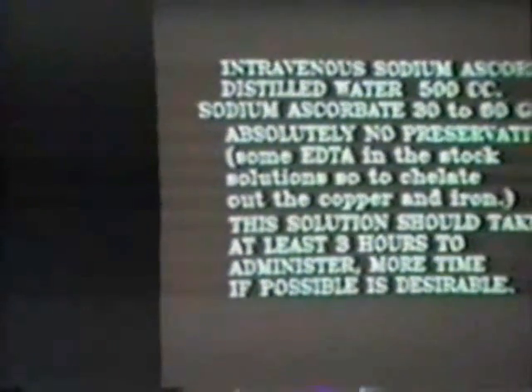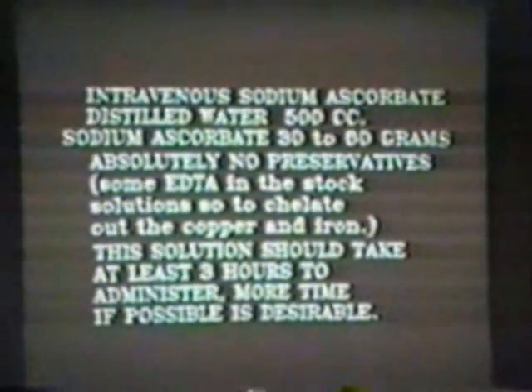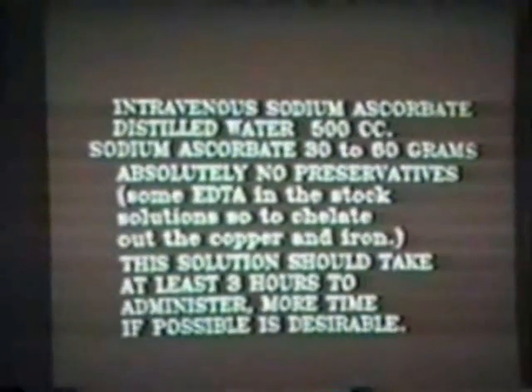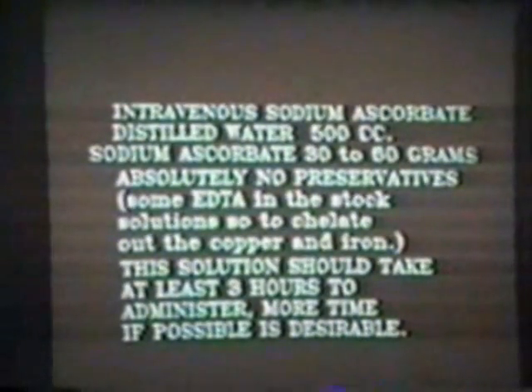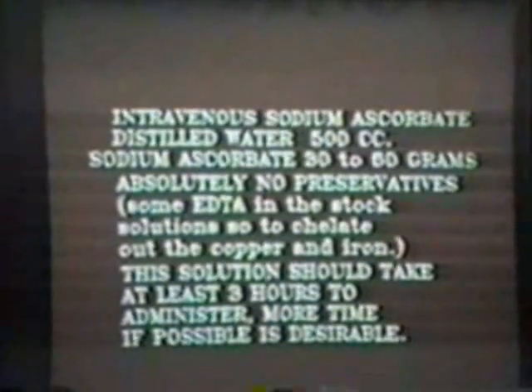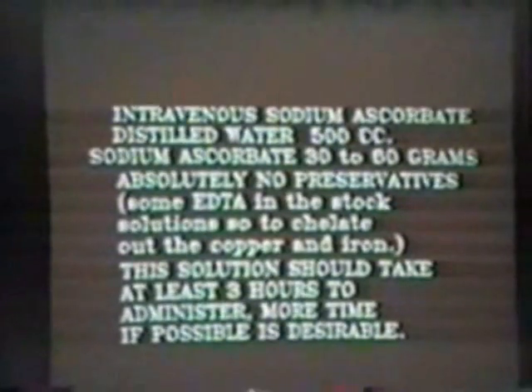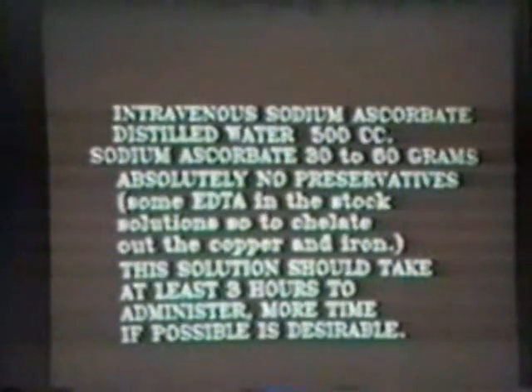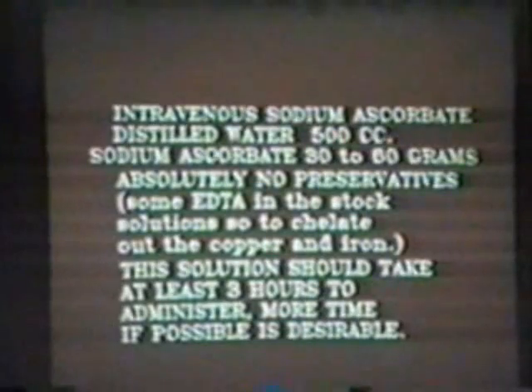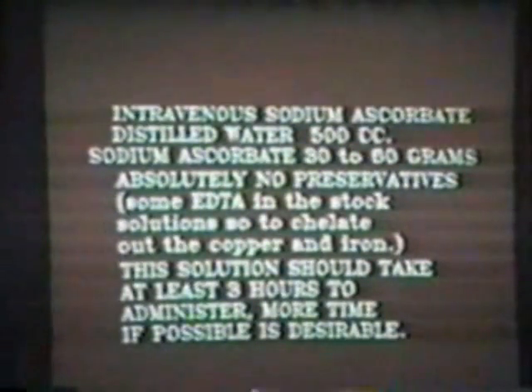So when we have that 50% stock solution, when we're going to use it, we draw it up into 500 cc's of distilled water. Actually, we draw off 120 cc's and add 120 cc's of the stock solution. That's 60 grams into the 500 cc's. It says distilled water. We sometimes use lactated Ringer's.